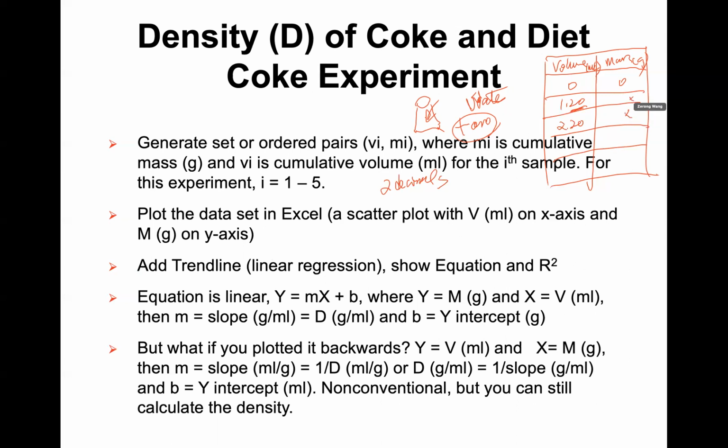But don't just write, say, 1 ml added. You don't write that. You will write it as a cumulative, because this one shows the total volume of water in the flask. You try to measure that, right? That's what shows the real relationship. And then in this case, you can add another, say, 1.2. So that will get it to 3.40 now, right?